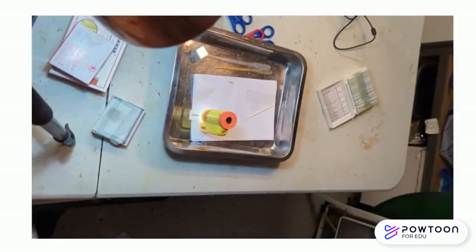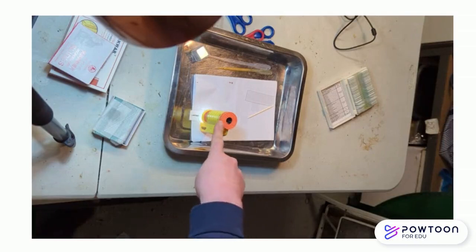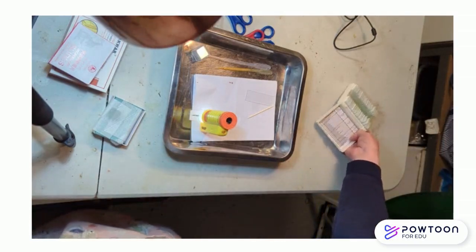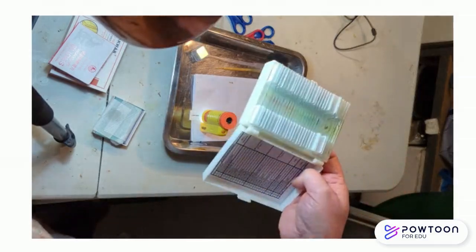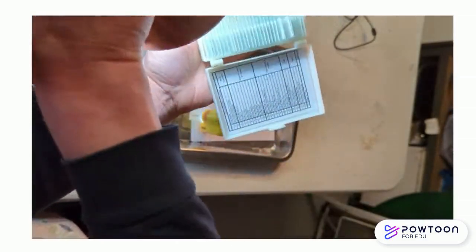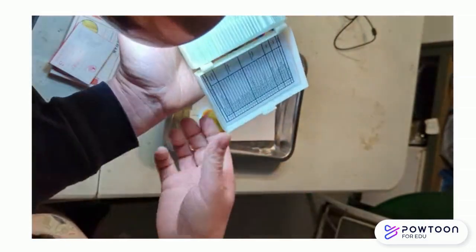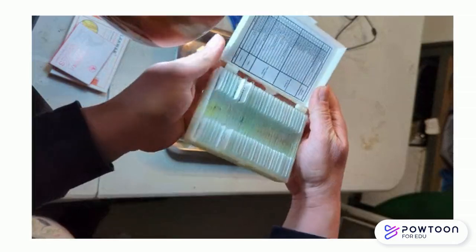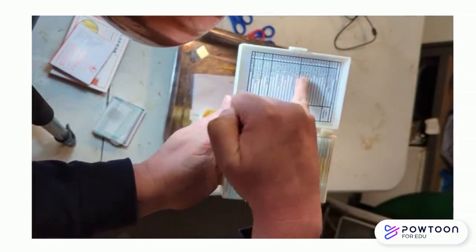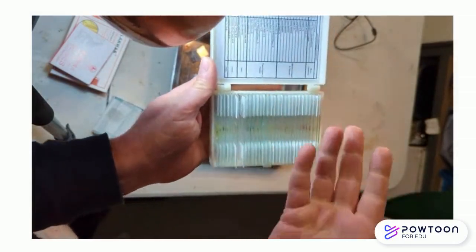Hello, and this is another training about how to use the microscope once the children have become used to it. As you can see now, we have got a microscope. Underneath, we've got a slide. This is a pre-prepared slide, and this is something that both juniors and seniors will use. But at first, ironically, it will be the juniors, because you do not have the time, and they haven't got the capacity to make their own. So first of all, show them that there's a list saying what each slide represents.